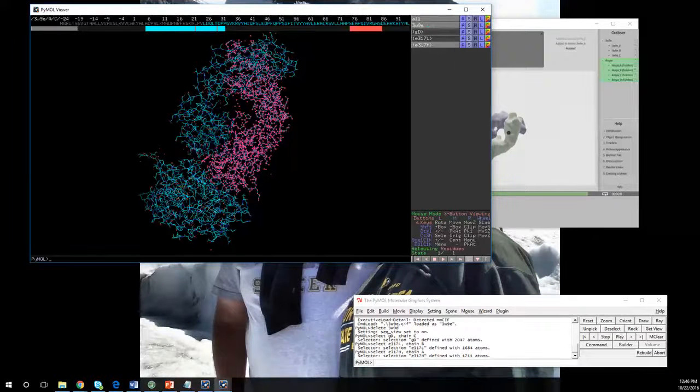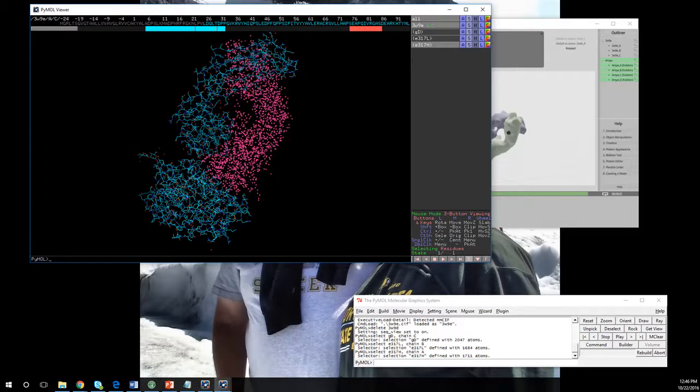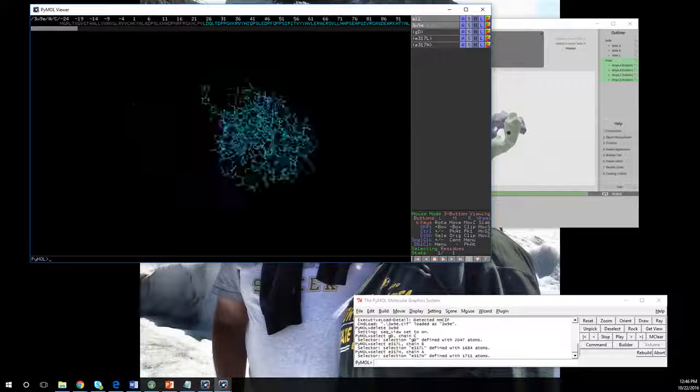Now I can just very quickly hide everything, and it'll hide that molecule. If I click and highlight it, it'll kind of show where it's at. This is selection. If I click off it, that's going to go away. So if I'm in E317 light chain, I can hide everything. And now I only have the GD molecule here.